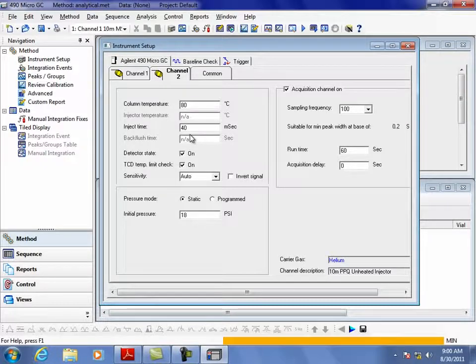The thing about chromatography, it doesn't like being turned off. Any chromatograph doesn't like being turned off. You're better off leaving it run all the time. You're going to use maybe 15 mils of gas a minute, milliliters of gas. In that case, that thing ought to last a long, long time, like months. So just leave it running. It doesn't take that much power.